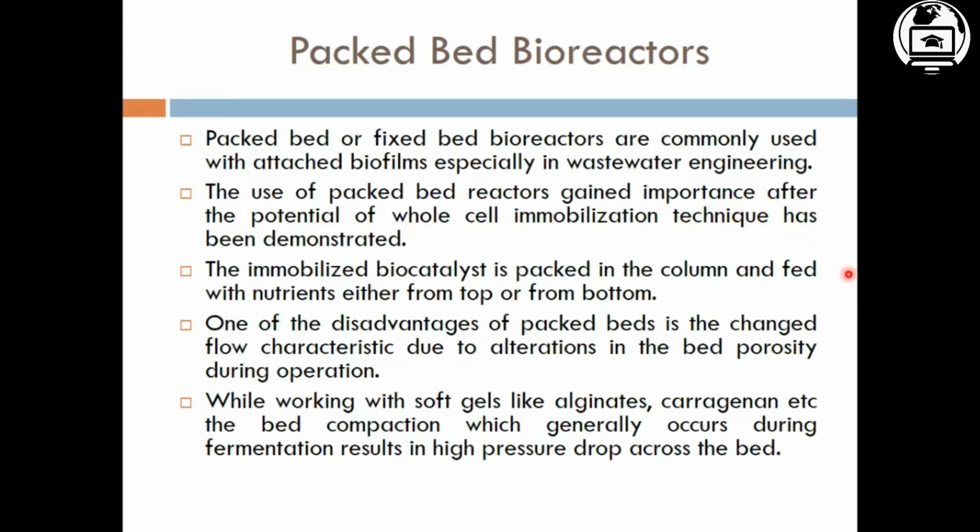It is similar to when you perform gel chromatography or ion exchange chromatography. You must know that there is some kind of material, like Sephadex, and when we mix that powder in water, it becomes a gelatin-like material.